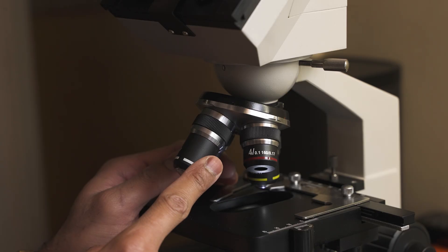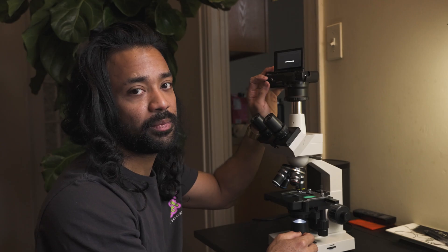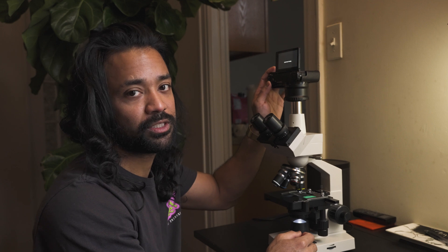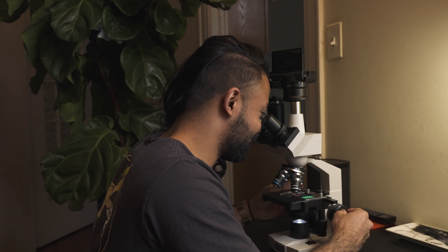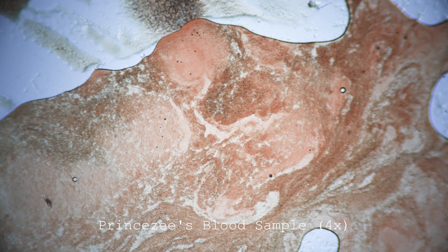Now we are ready to look this up under the microscope. We're gonna start off with the lowest magnification. Let's place the slide under the microscope - I'm gonna be taking pictures and videos so you guys can see what's inside my blood. You know in your elementary school biology textbook how it shows a picture of blood - that little round oval shape that looks like an airbag? That's exactly what it looks like, which is crazy. And you can see some of the white blood cells here too.